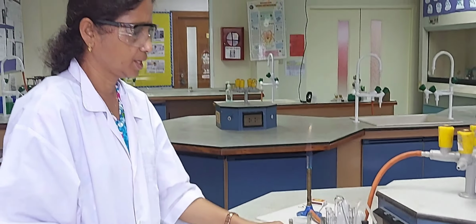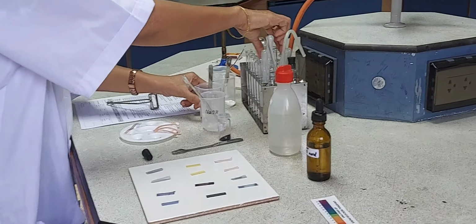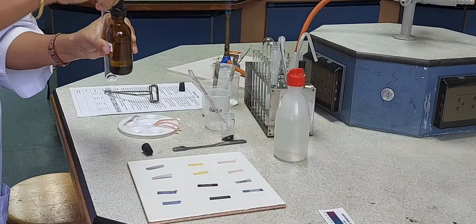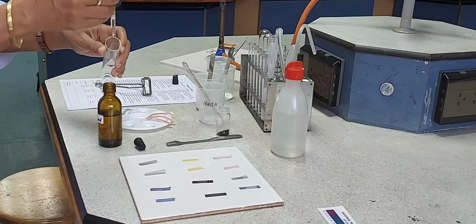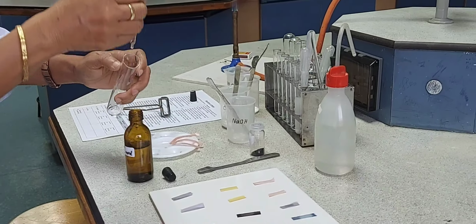Okay. Then we take a little of the calcium hydroxide and add it to the boiling tube in 2 ml of dilute hydrochloric acid, which is 2 molar concentration.